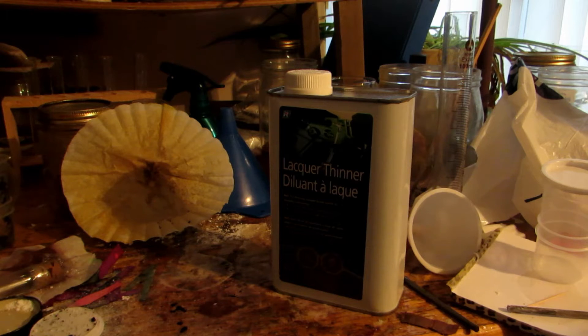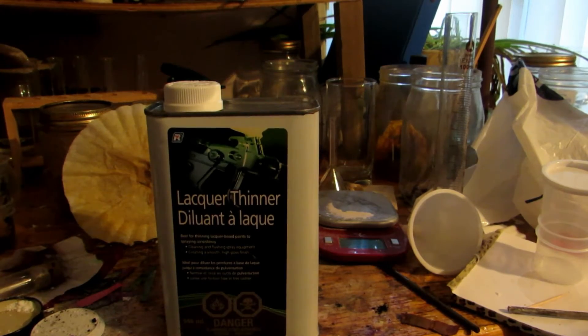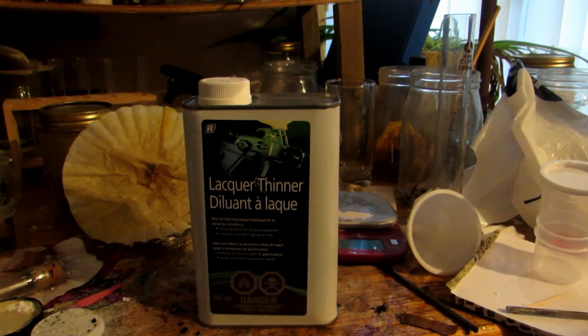Hey guys, welcome back to another video. Toluene is an extremely useful solvent in many different applications, and this lacquer thinner which I bought at Home Depot contains a fair amount of toluene. I looked at the MSDS online — it's between 40-something and 80-something percent toluene, and the rest is methylethylketone and methanol. The methanol content varies between 15% up to about 40%, so I'm not totally sure how much is in this product, but according to the MSDS, toluene is listed as the first ingredient, which normally means it has the highest content.